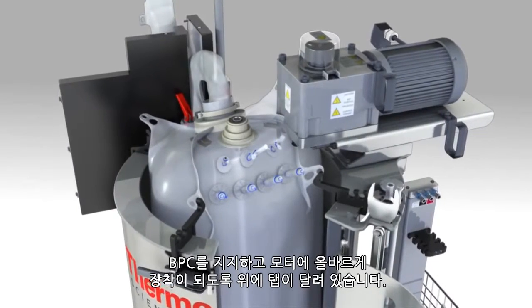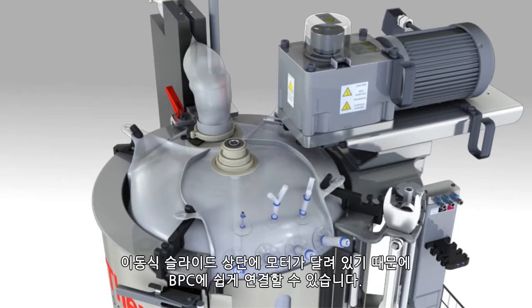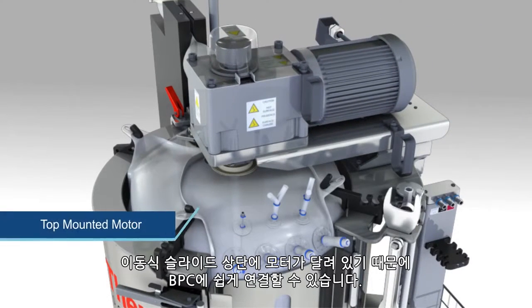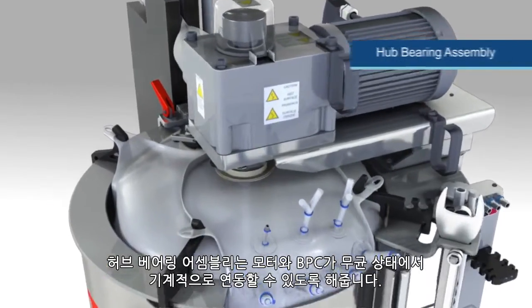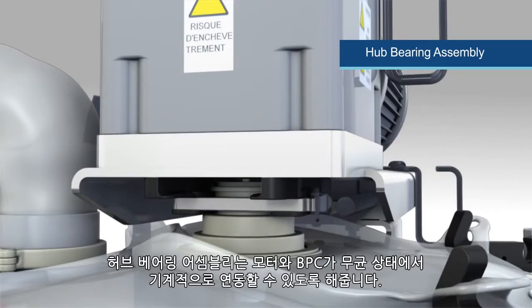Top-hanging tabs are provided to support and correctly align the BPC with the motor. A moveable slide top-mounted motor makes it easy to connect to the BPC. A hub bearing assembly provides a sterile mechanical coupling between the motor and the BPC.